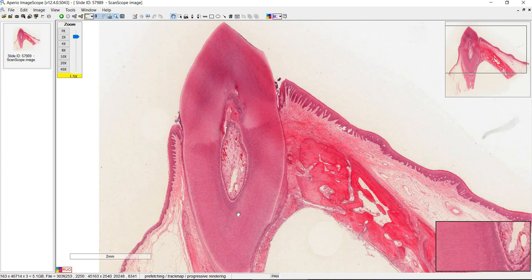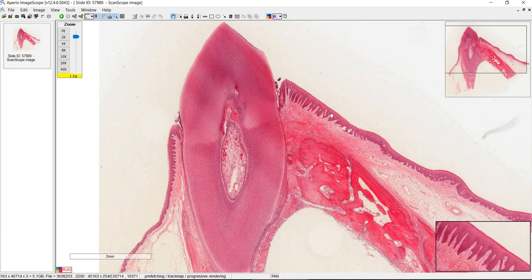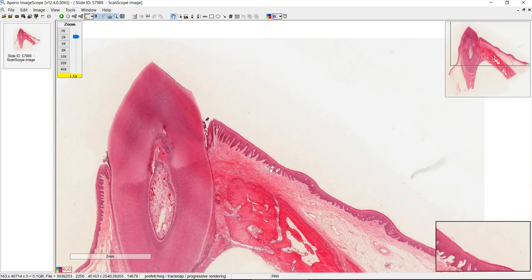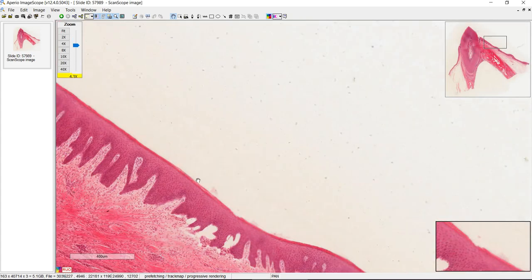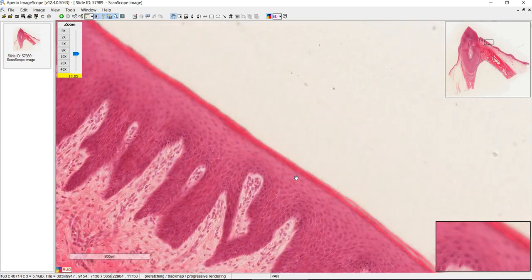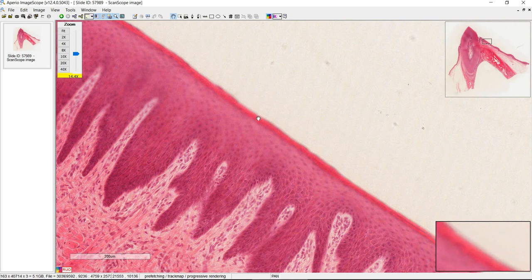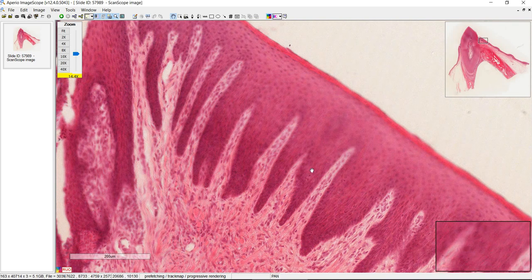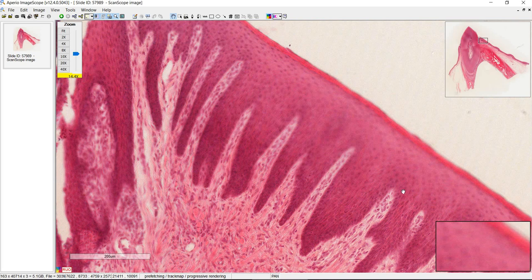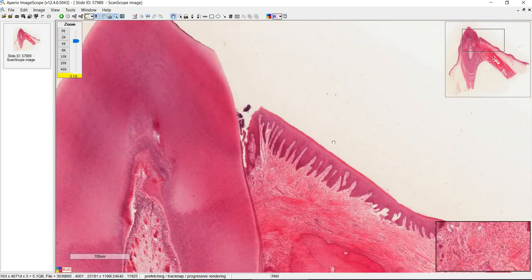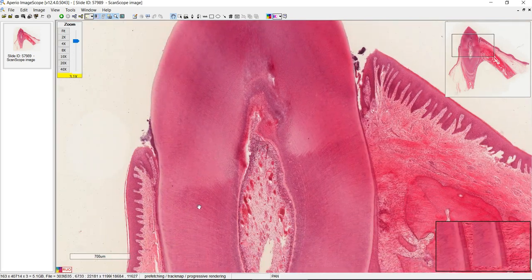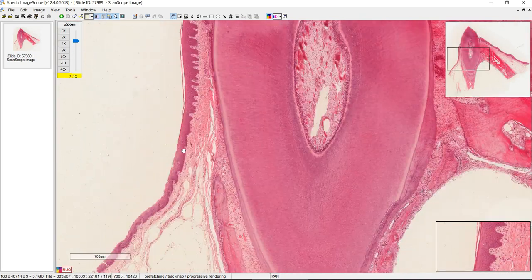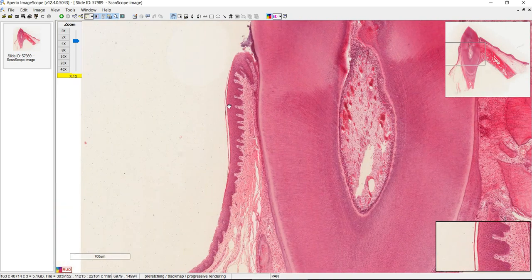This is the tooth and it's inside the gingiva which is a stratified squamous epithelium and it's keratinized stratified squamous. You can see a very thin layer of keratin here. So gingiva and the hard palate will have keratin on its stratified squamous epithelium as opposed to soft palate and the inside of your cheeks that's not going to be keratinized.